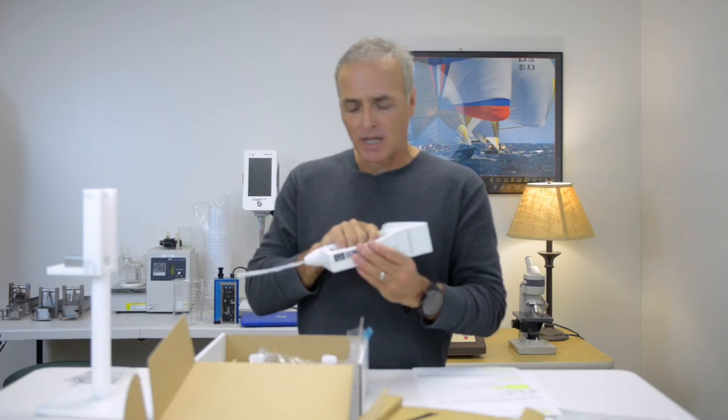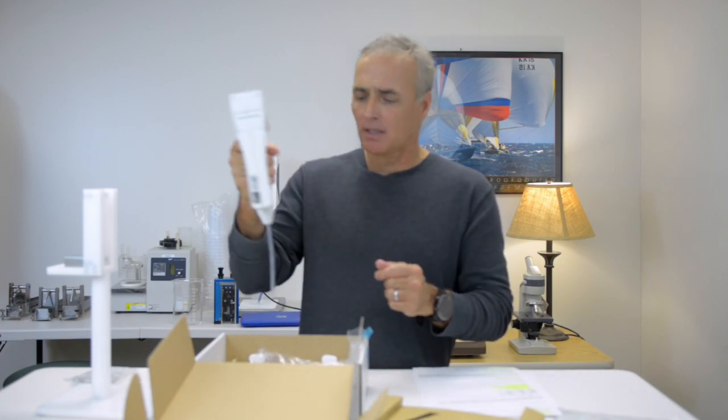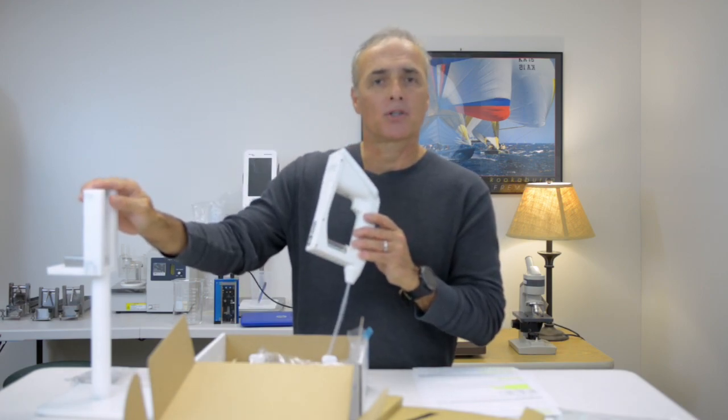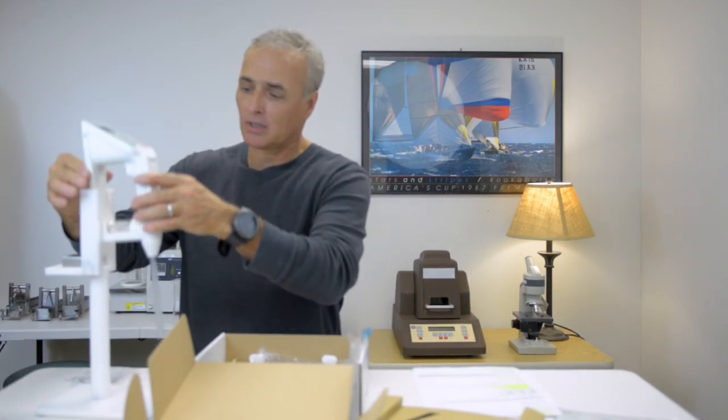As far as functionality, you can hold the instrument like this, but we also have a handy mount if you want to turn this into a portable benchtop, where it just sits in here like so, and you can put your samples on the counter and take measurements.